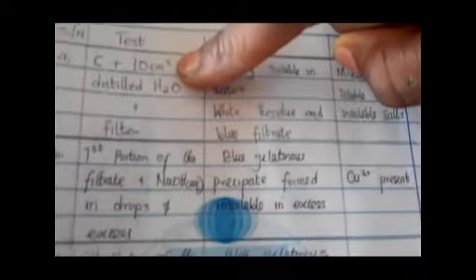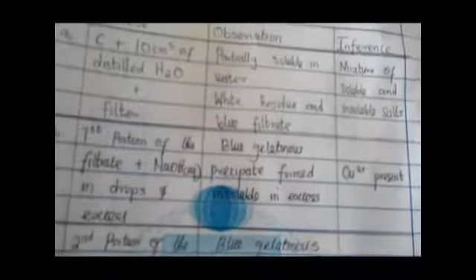Good day again, viewers. As you can see, we started our practicals and we are carrying out our inference test. Now when I'm done, I'm going to show you my results and how I input them into my table. I'm done with my inference test practical and this is my table of values. From the question, we were asked to add 10 centimeter cube of water to our sample, which is C, and then to filter. We observed that it was partially soluble in water, a white residue and a blue filtrate was observed. Then our inference is that C is a mixture of soluble and insoluble salts.